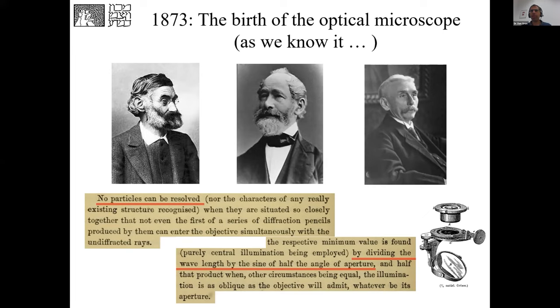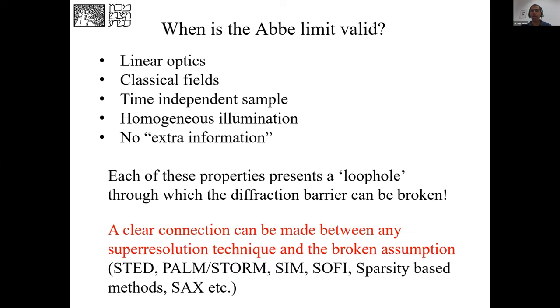Okay, so you could say that the science of quantitative optical microscopy was born in 1873 and died immediately after because the utmost limit of resolution had already been achieved, or was it, you know? So it took us somehow, sort of hard to answer why, 120 years to start questioning the Abbe limit. Can you actually get in a far field optical microscope resolution which is better than the diffraction limit?